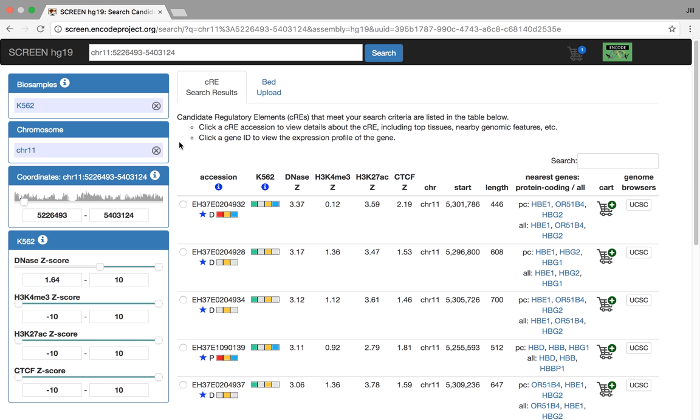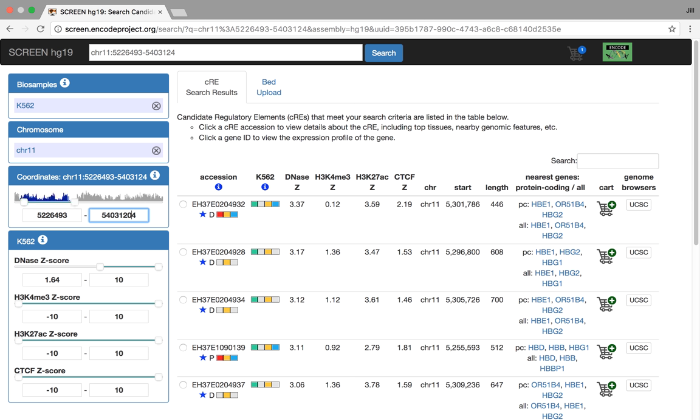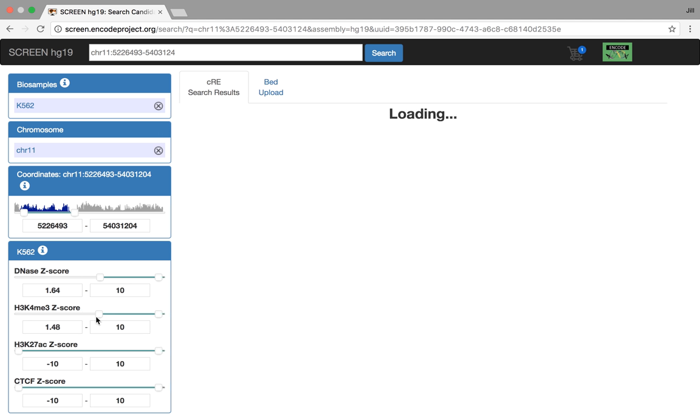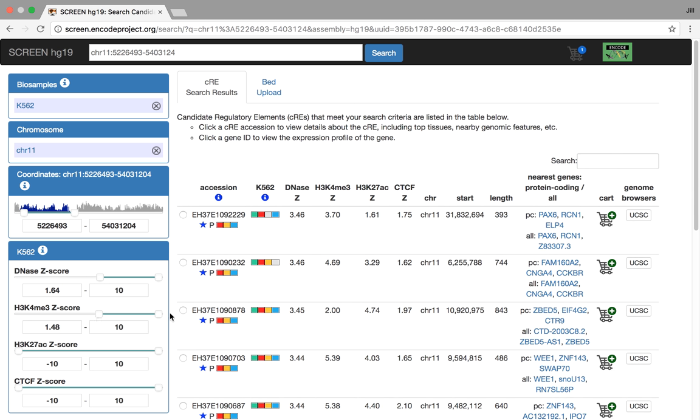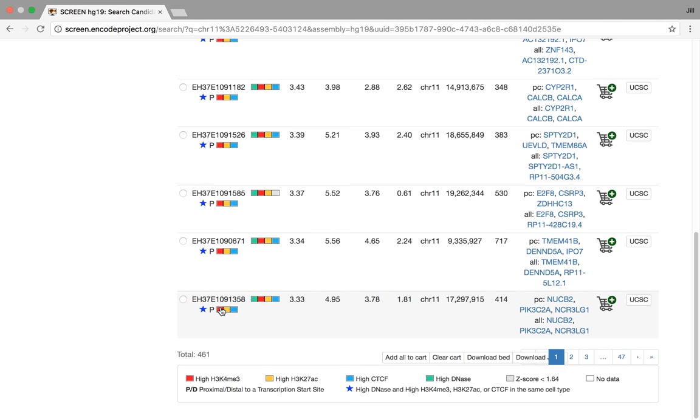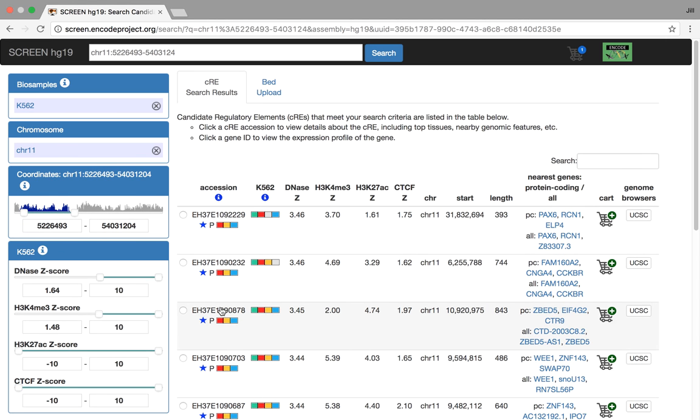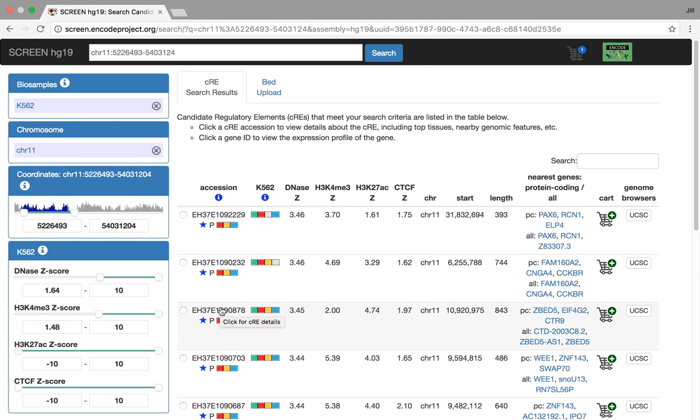We have other facets here. We can change the chromosome if you would like, you can change the region manually, and you can also adjust the Z-score thresholds. For instance, if you were interested in CREs that have promoter-like signatures, you could bump up the lower threshold for H3K4ME3 to something maybe 1.64 or 1.4, and the search will repeat with a smaller number of CREs returned.